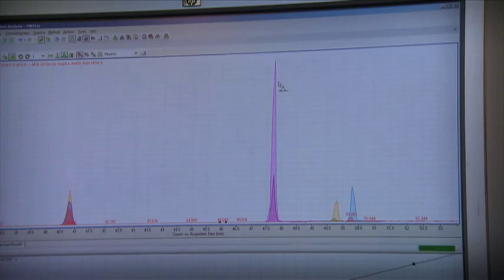The final task is to identify the compounds and quantify the concentration in the samples. To do this, we inject standard solutions containing different known concentrations to create a calibration curve. We use the areas of the peaks belonging to the right retention time and the M/Z transitions to establish the concentration of the PFCs.